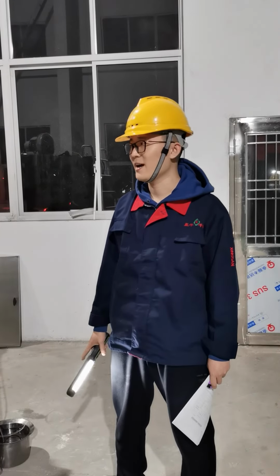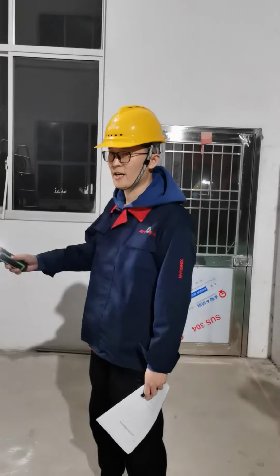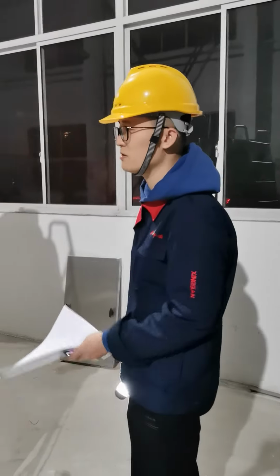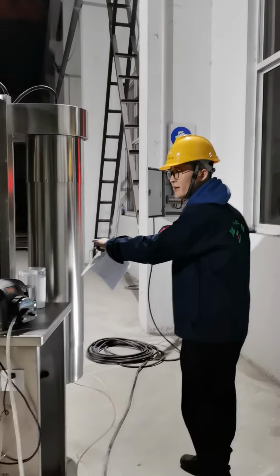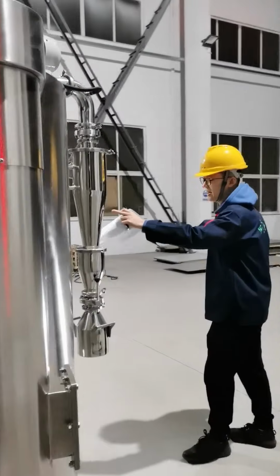Hello, this is an operation guide video. First, let me introduce the components of the spray dryer system. First of all, this is the spray dryer tower, and this is the main host, and this is an electric heater here, and here this is a cyclone.